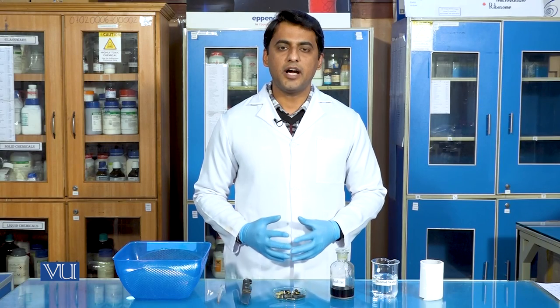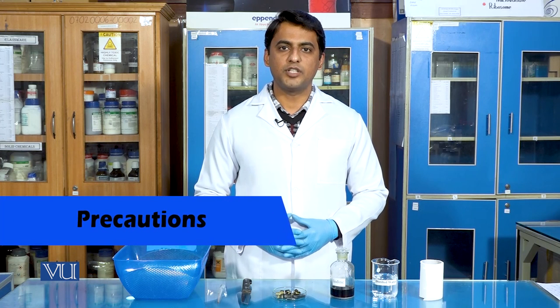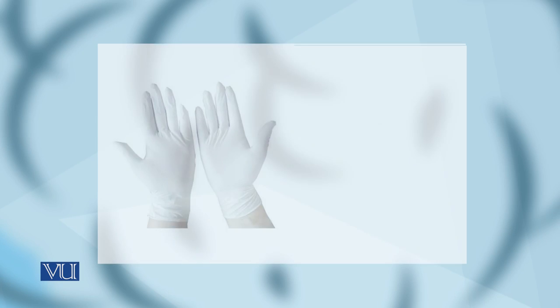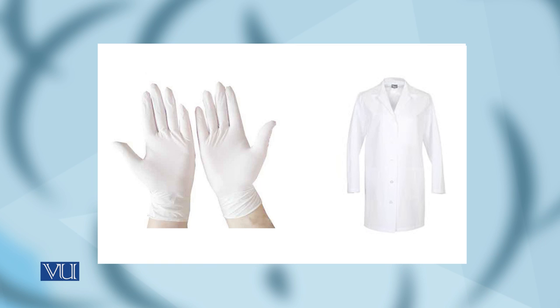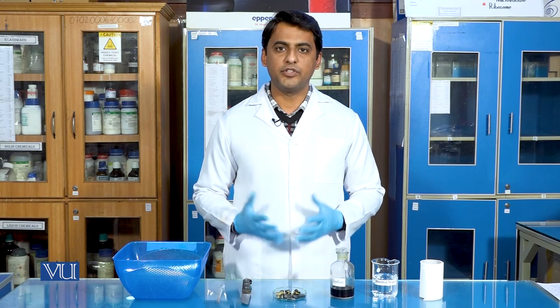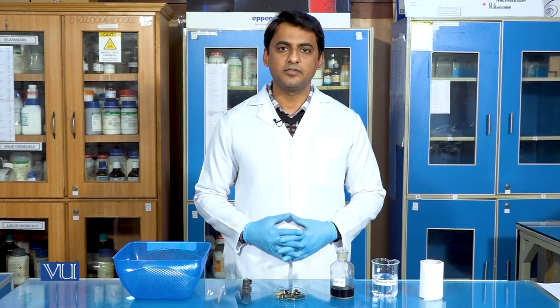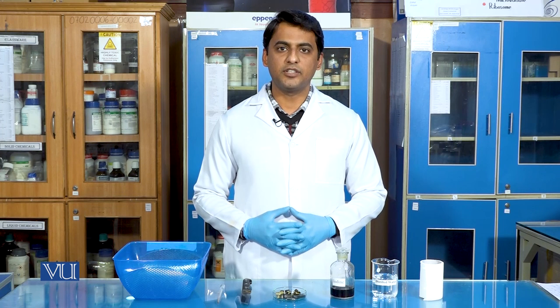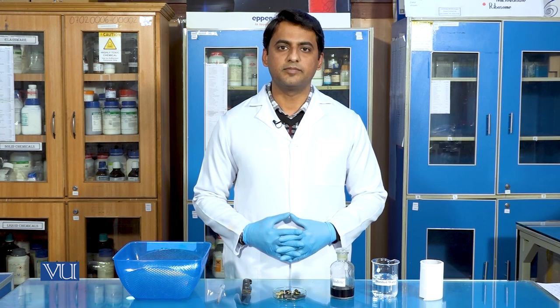In the end, I would certainly like to recommend some precautions during this experiment. The very first is: do not forget to wear hand gloves and a lab coat. Avoid contact of any reagent with your hands and body. And finally, discard every consumed material properly. Thanks.